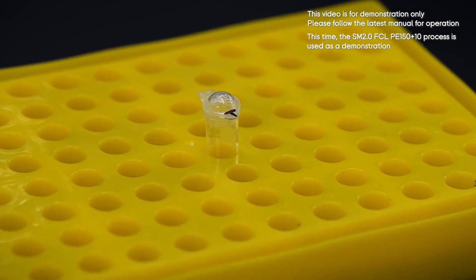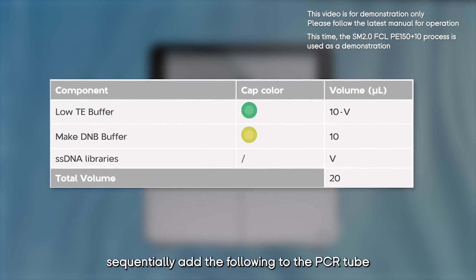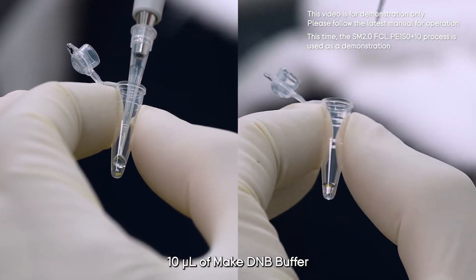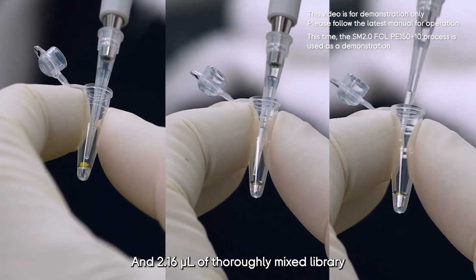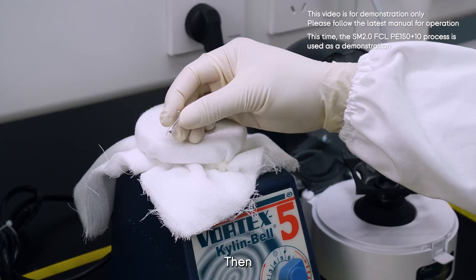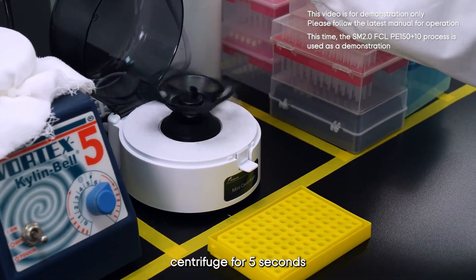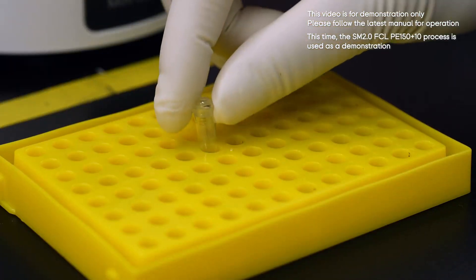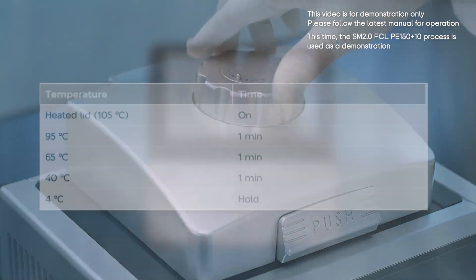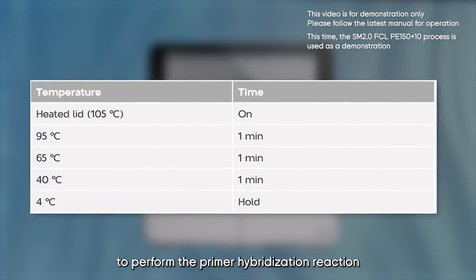Once the reagents and library are ready, take a 0.2 milliliter PCR tube and label it accordingly. Following the manual instructions, sequentially add: 7.84 microliter of Low TE buffer, 10 microliter of Make DNB buffer, and 2.16 microliter of thoroughly mixed library. Then vortex the PCR tube to mix well, centrifuge for five seconds, and place it in the thermocycler.